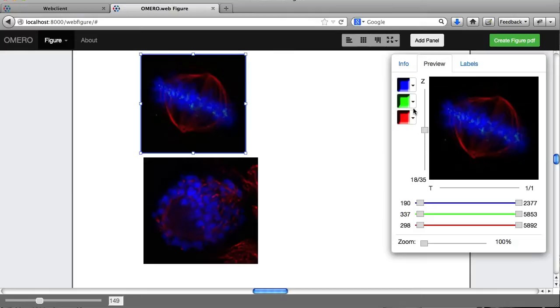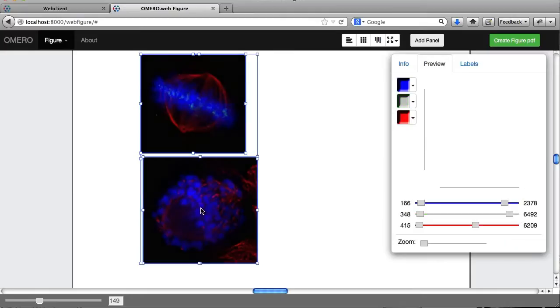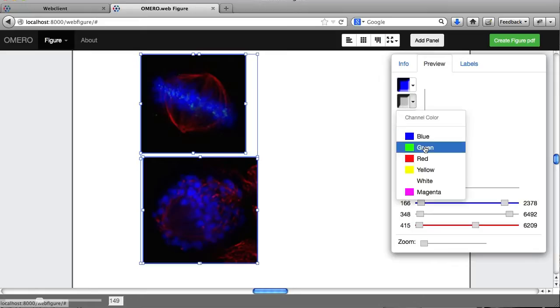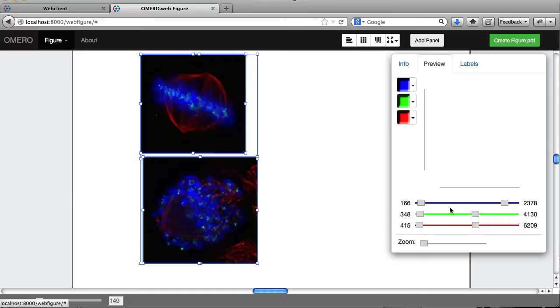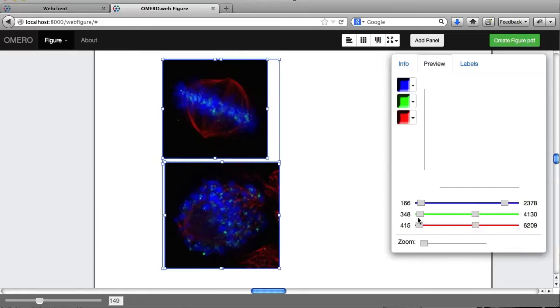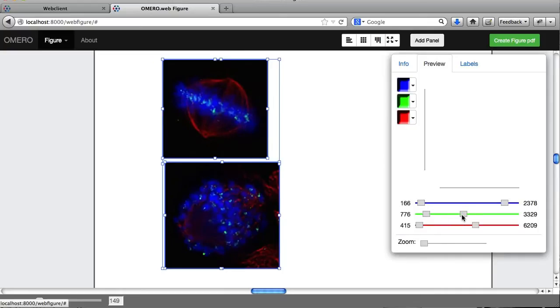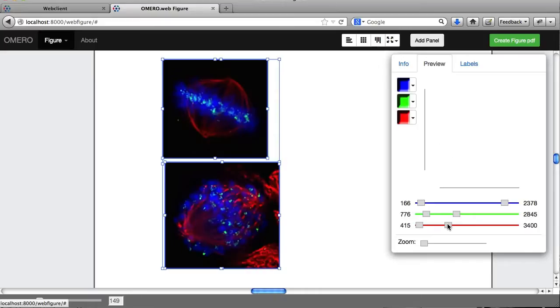I'm going to select both of these panels. And anything that you can do to one panel, you can do to both. So if I choose green, they'll both change to green. And if I boost the levels, that's happening for both. Cut down the background. Looks pretty good. I'm going to do the same for the red channel. Great.